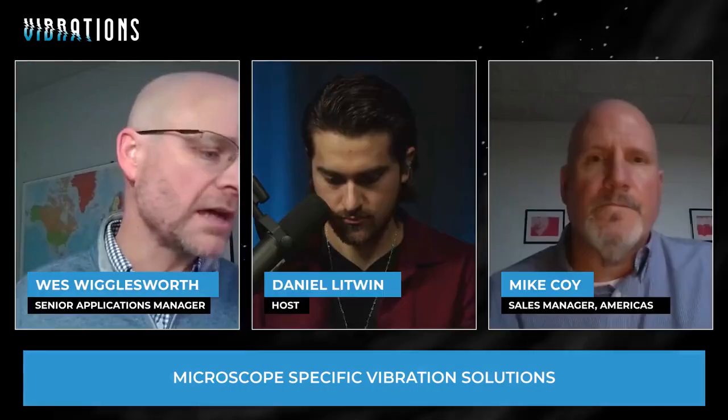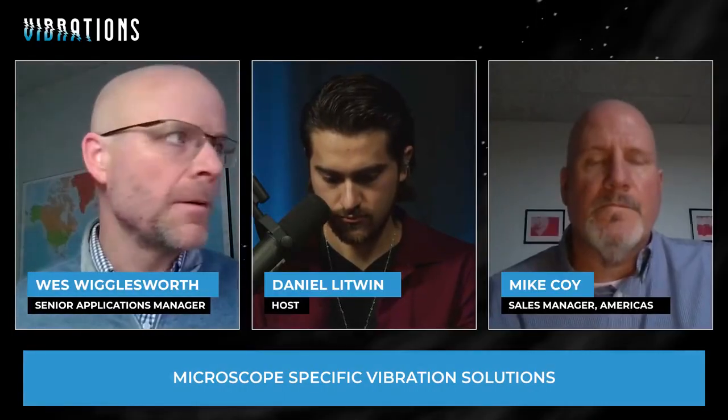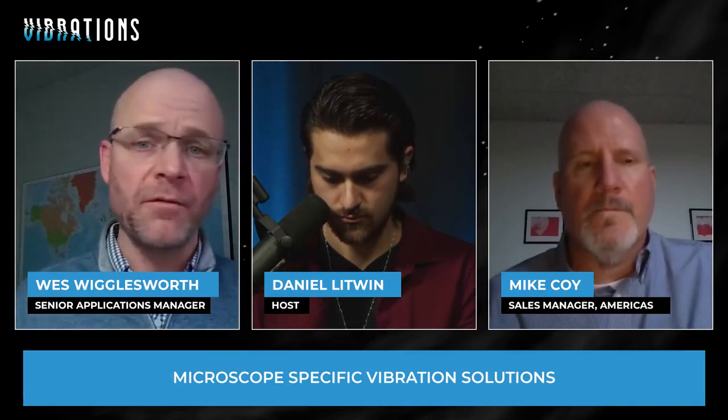To address external vibration, we've already talked about how to measure that, how to analyze that, where it's coming from. It can be coming from everything you mentioned, and it is. Well, that external vibration is very often at very low frequencies. And that's why an external platform or external base is needed to support these microscopes in the environment in which they need to be installed.